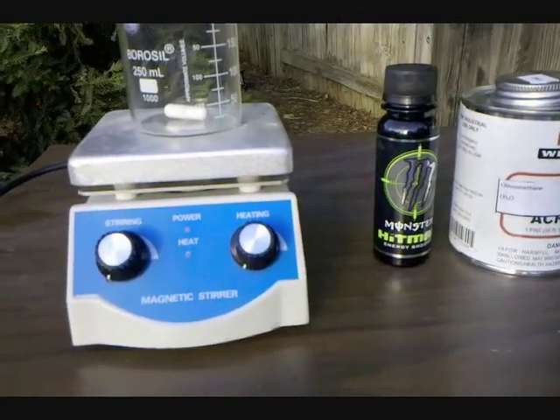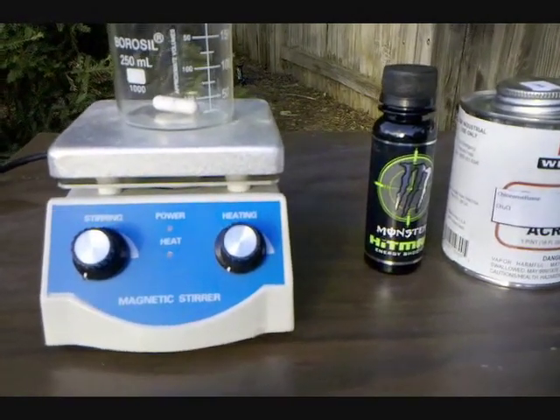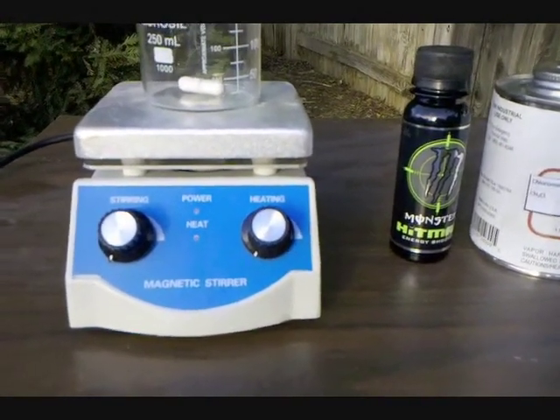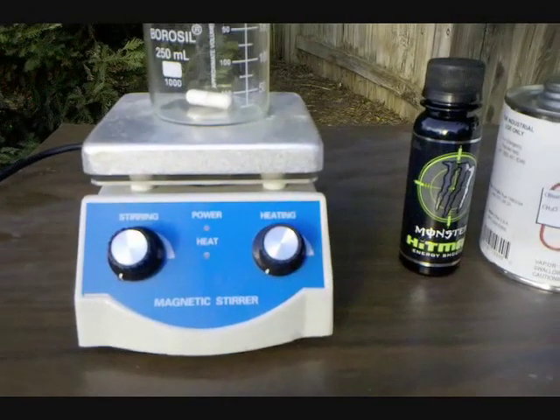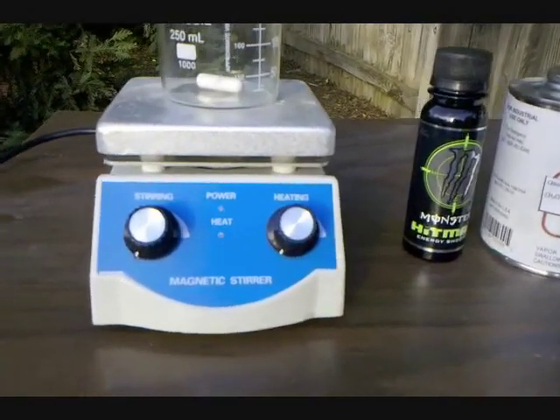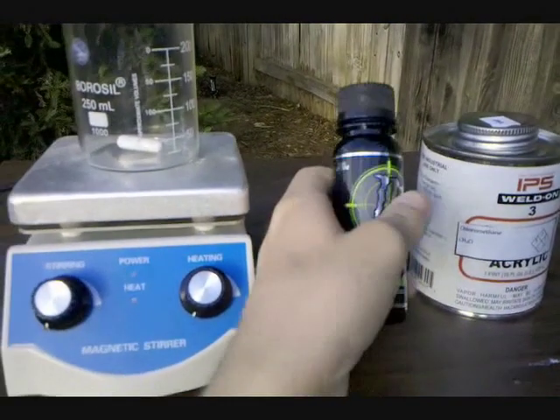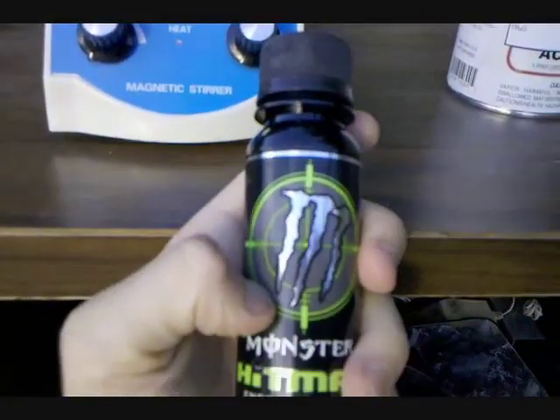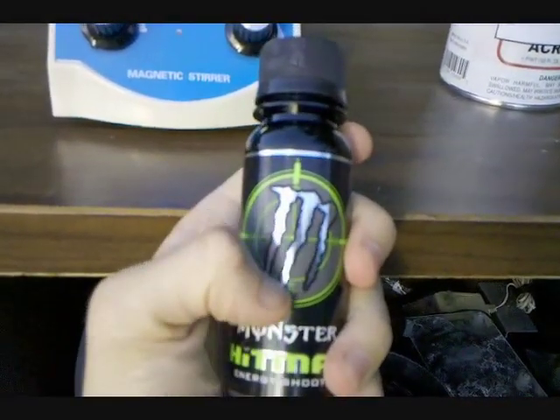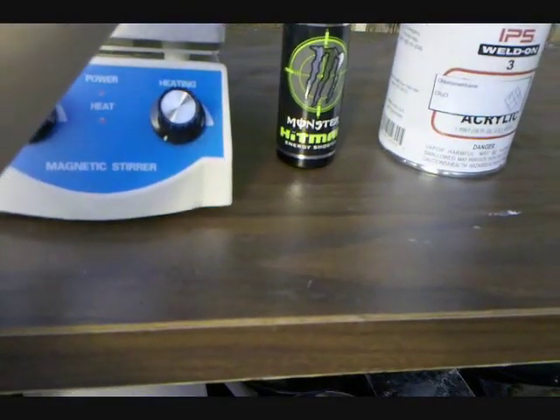Hey everyone, welcome to my video on isolating caffeine. First thing I have to say is I don't know how pure the caffeine is here, and even if it was pure, it is not safe for consumption. I'm only doing this so that I can have a sample and to say that I did it. I'm going to be isolating it from a Monster Hitman energy drink — I'm using this because it has the most caffeine I could find for the smallest volume, and it's not carbonated so I don't have to deal with that.